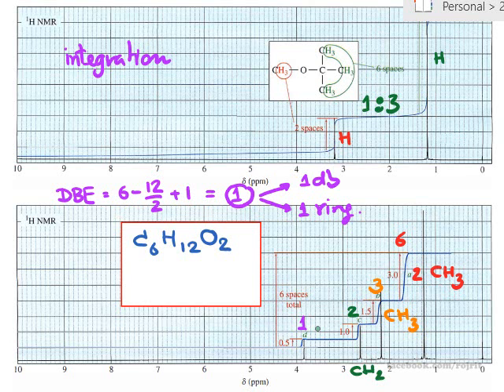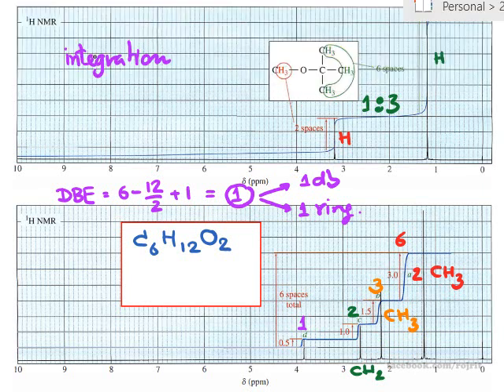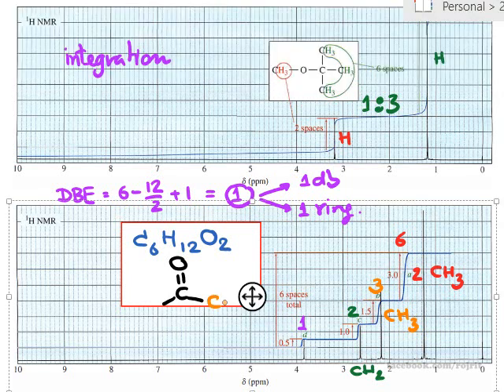I'm not sure. But anyway, as you look at the position 2 point something, 2 point something meaning that you have a carbonyl group, right? Or an aromatic group, right? So now I want to guess that we have the carbonyl. So if we have a carbonyl group, carbonyl has 2 sides, right? So one of the sides should be CH3, right?